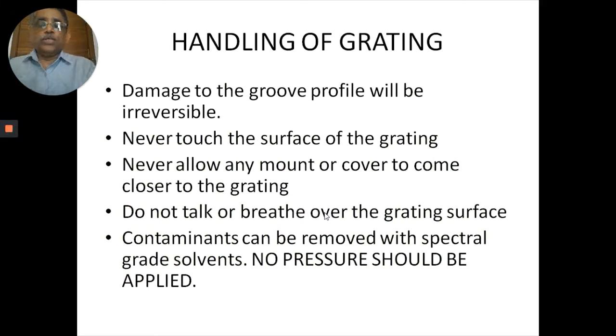So once you have your machine available and when you are using it, important is handling of the grating. It's so sensitive, you should not damage it. Once you damage it, you lose your spectral resolution. It will create irreversible damage to the groove profile. If you physically touch it, even finger marks can really damage the surface. If you touch it with just a bare hand, you will see finger marks that will really create disturbance to your spectral patterns.